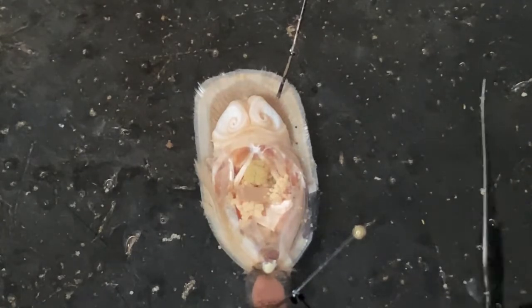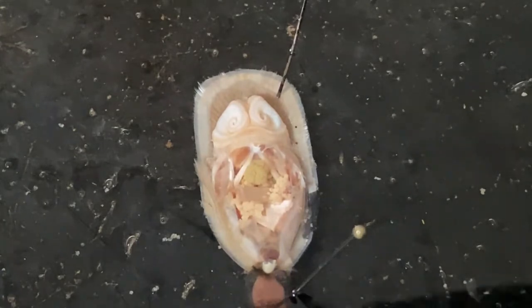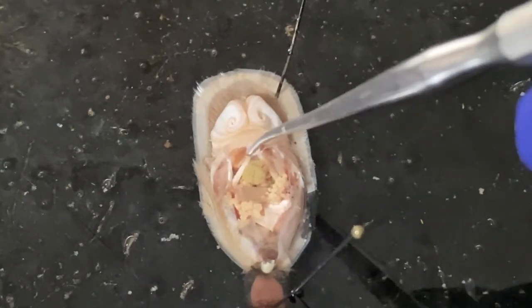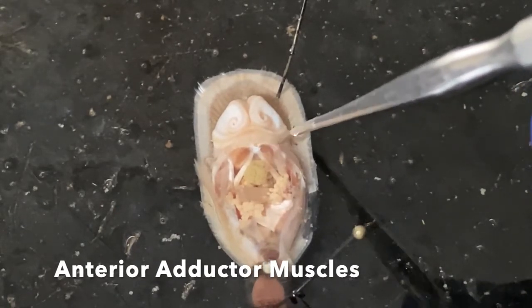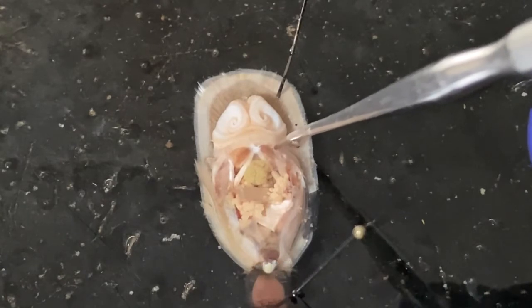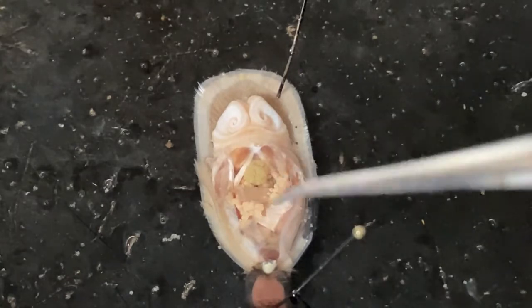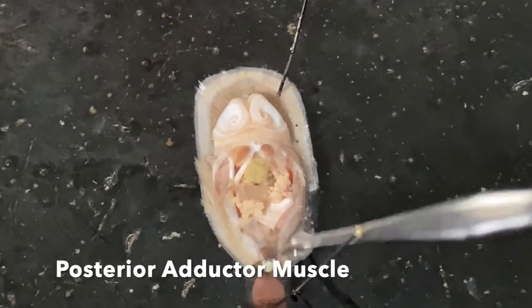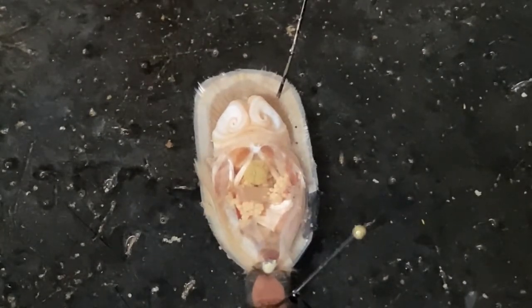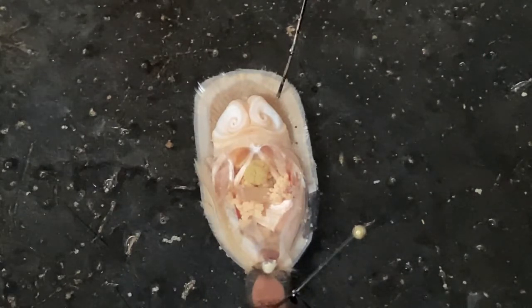Okay, let's take a look at the musculature. So what we have up here, these two pinkish structures, one right here and another one right here that's partially obscured, these are the anterior adductor muscles. So these muscles attach both shells to one another and can clamp them together. At the posterior end of the animal down here, this other pinkish structure is the posterior adductor muscle. Now these are inarticulate brachiopods, which means that they don't have a hinge. They're just held together with their soft tissue.